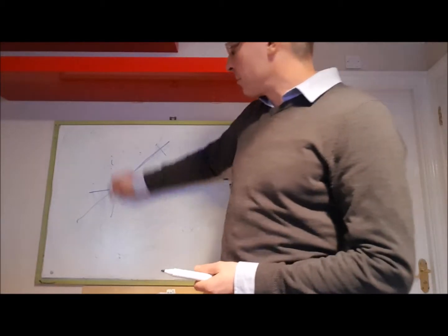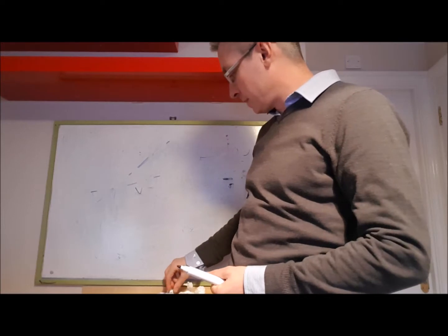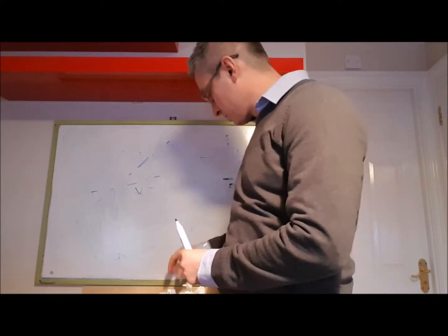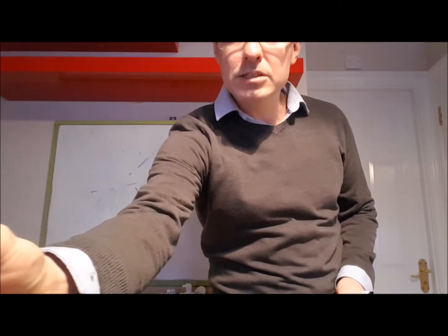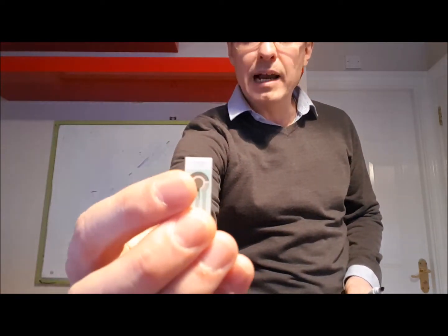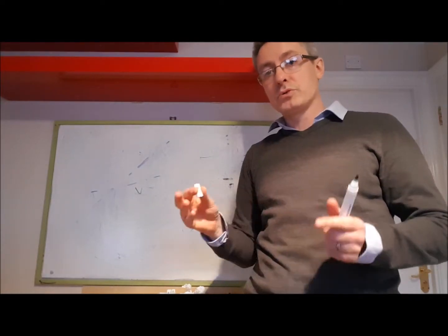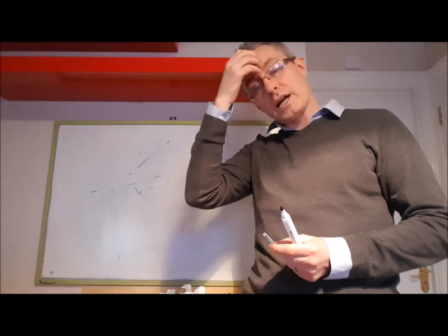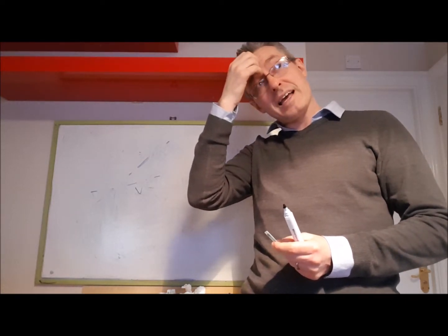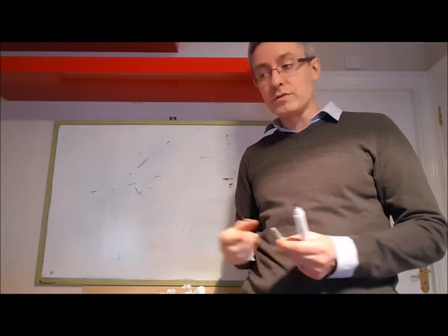I am thinking, actually, we have electrodes that look like this, and I might suggest not using these big electrodes because of a problem called IR drop. If you try and push large currents through oils, you'll basically be measuring quite a large resistance, and you'll lose all the features.